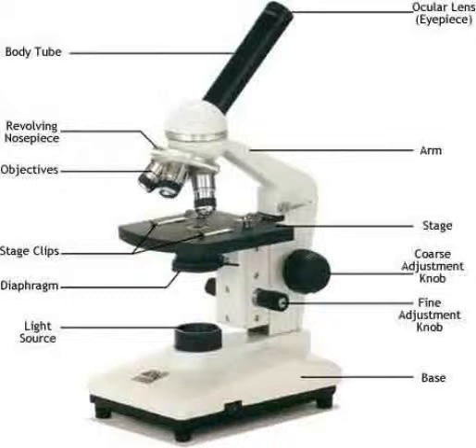Procedure for this lab. Using your microscope. Number 1. From the classified section of the newspaper, locate a lowercase r. Place the r right side up on the slide. Place a small drop of water on the slide. Place one edge of a cover slip on the slide next to the r. Gently lower the cover slip onto the r.